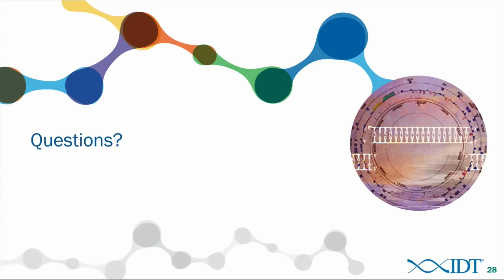So the in vitro system, the results were pretty good for a variety of different constructs, but it was really in cells where the Alt-R system shows its benefits. That's correct. Okay.